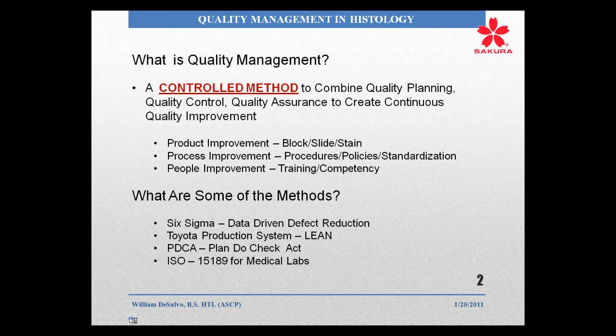And then if you go back several years to the beginning of quality management and Deming, the PDCA, that's Plan, Do, Check, and Act. And when you think about it, plan, do, check, and act, a lot of us, a lot of our labs in histology, we're probably informally doing that part. But most importantly, one of the methods out there is ISO 15189 for medical labs. It is the next step on the ladder, and it's something that we all need to become very well aware of.